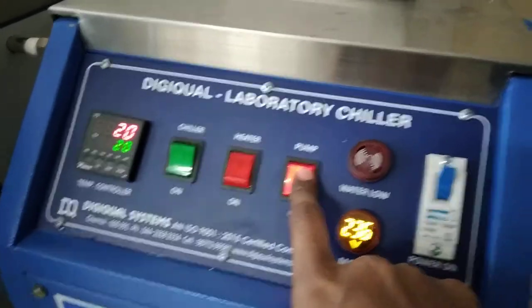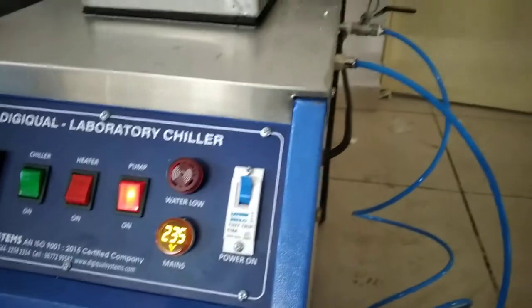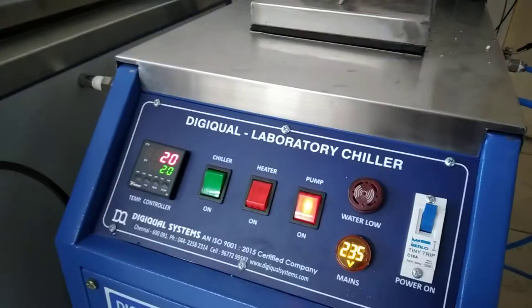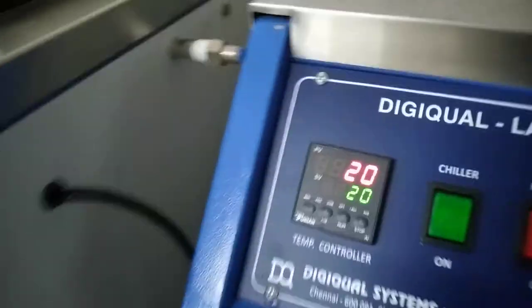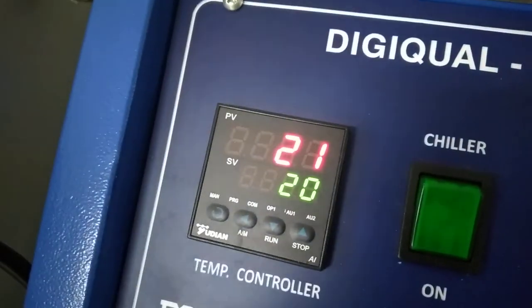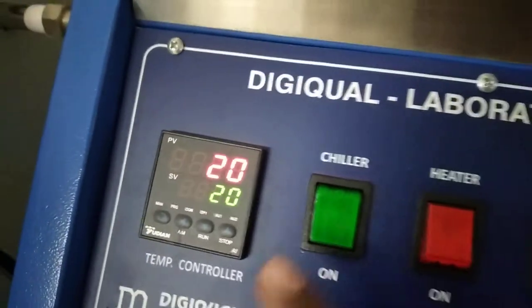We can switch on the pump. The pump should be switched on when it is ready for the recirculation. Pump is off. Now the setting temperature is 20 degree — it is getting maintained.